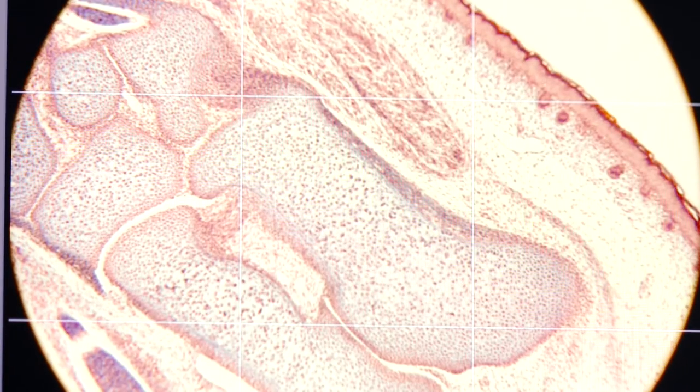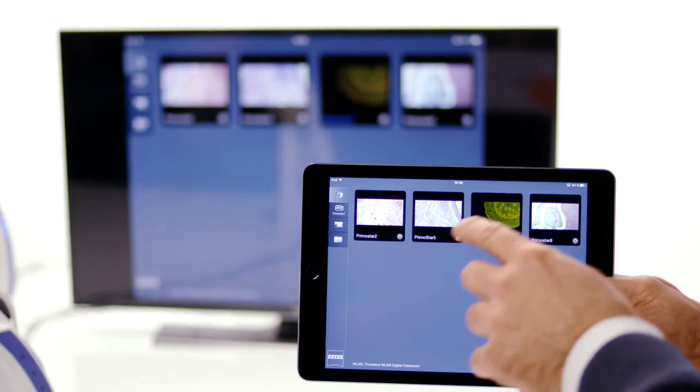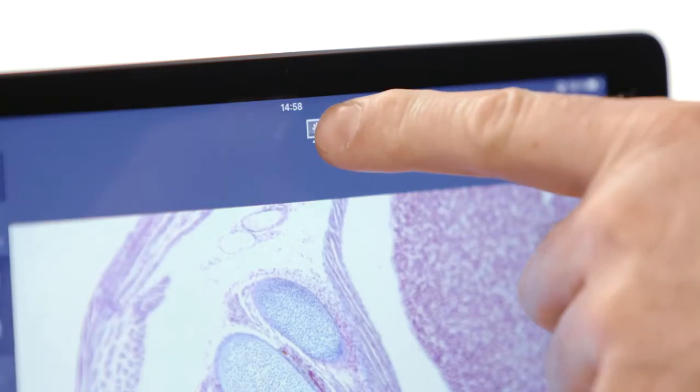When you find a region of interest on your sample, start SAIS Labscope and activate the laser pointer function.